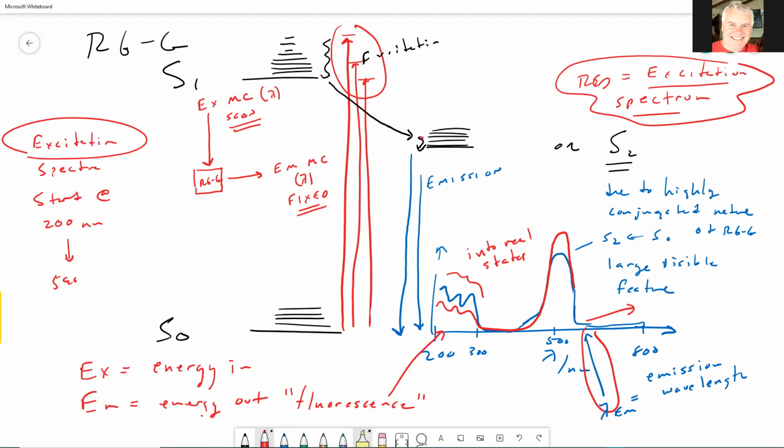Now we just talked about the excitation spectrum, and I've been talking for literally 30 minutes nonstop here. And so I need to engage one or more of you a little bit in some conversation about this and see how we're doing in terms of understanding stuff. So even though this almost never works, I'm sorry, but let me just open it up for questions and see if there are any questions.